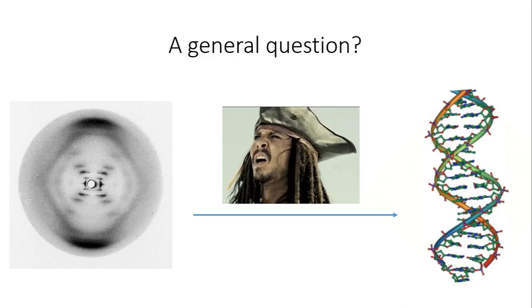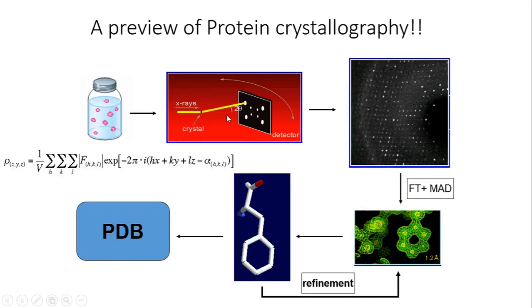Okay, so to begin with, we would just have a brief preview of the method called protein crystallography. Let us first try to understand what protein crystallography is.